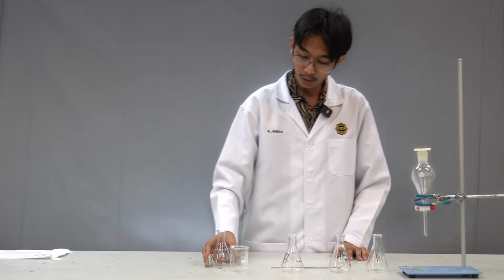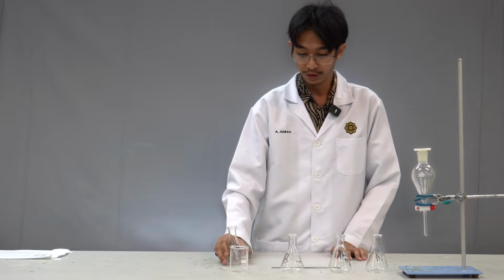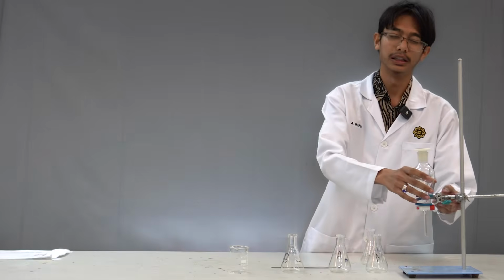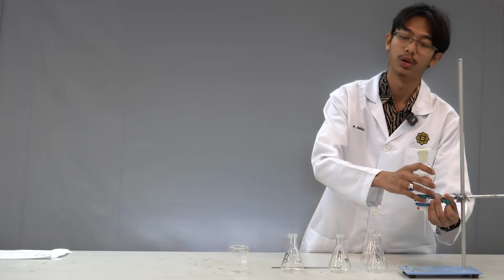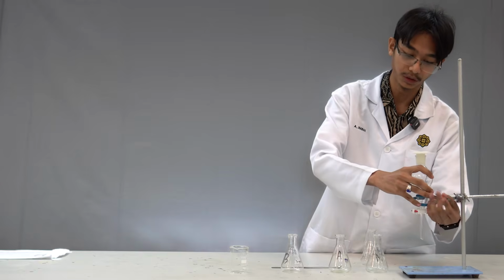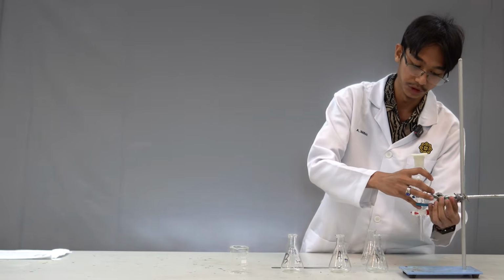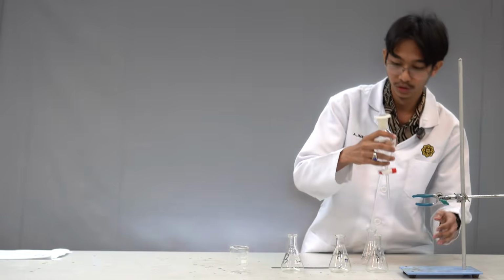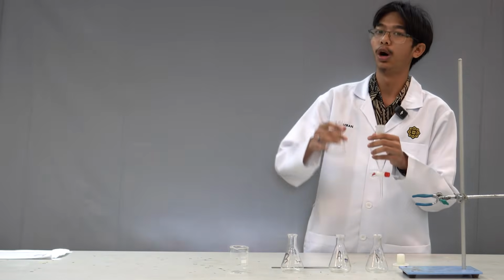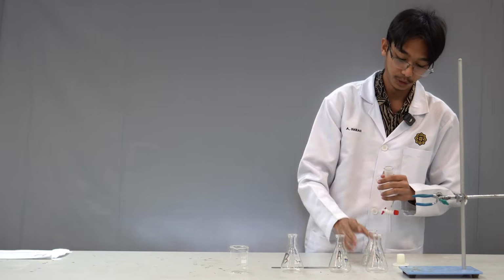When you have that mixture, first you're going to have to get it inside our, what is this called? Our funnel, right? To get it inside the funnel, let's just remove this, shall we? You're going to remove the cap. We're just going to pour our liquid mixture in. Simple.